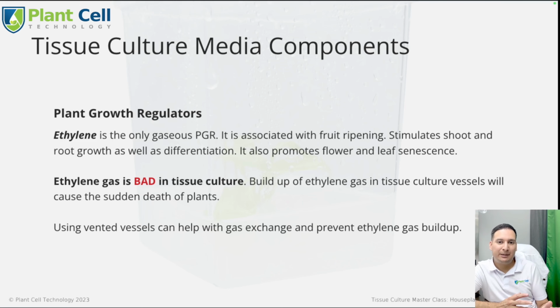The more BA you add, you may think that is the best, but sometimes it actually slows down the multiplication. So I found that about 3 milliliters for monsteras is about the sweet spot, and about 1 milliliter for pretty much most of the other houseplants works great.